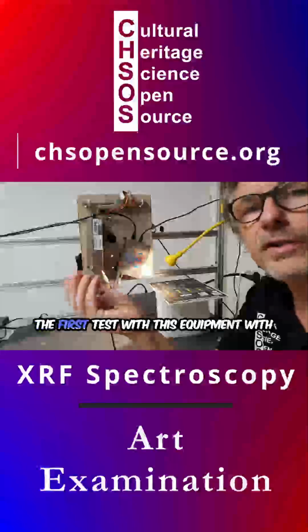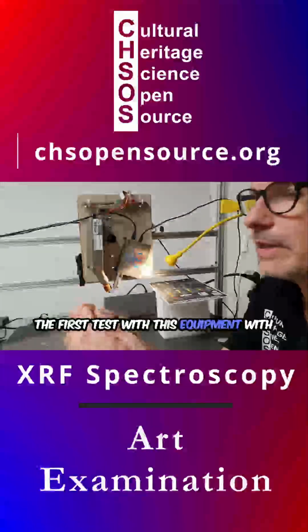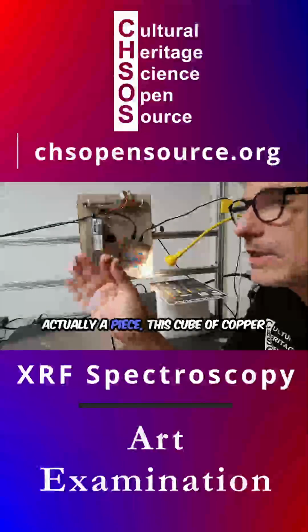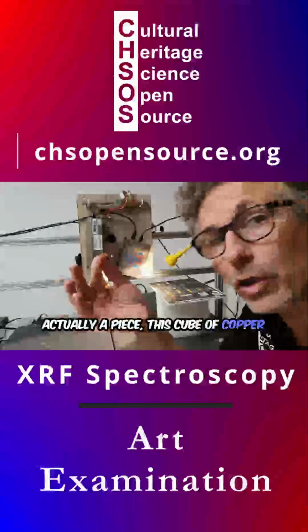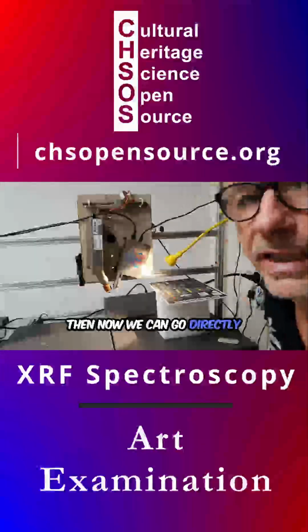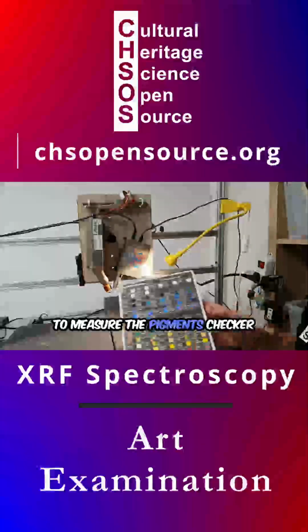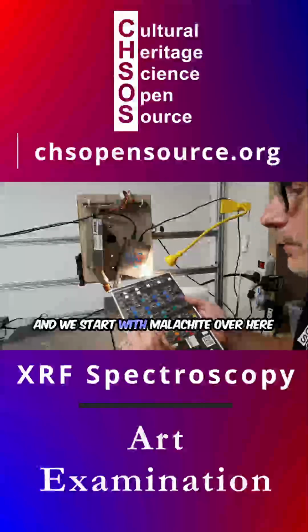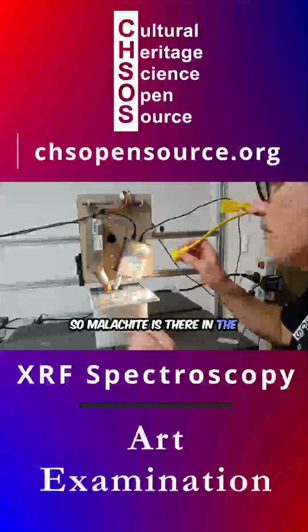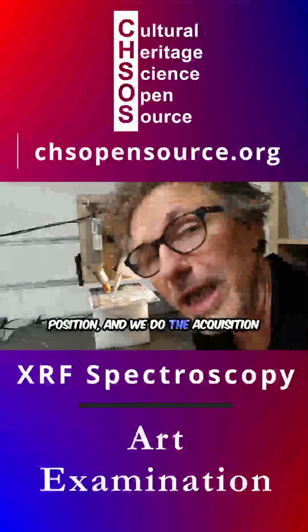The first test with the XRF spectrometer could be to test this cube of copper. Then we can go directly to measure the pigment checker, and we start with malachite over here. Malachite is in position, and we do the acquisition.